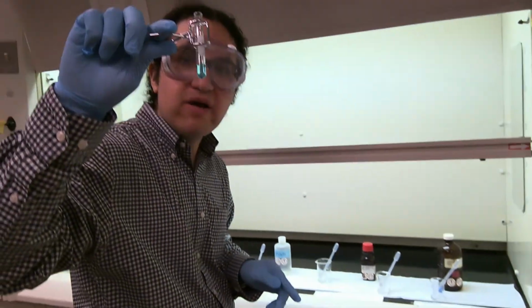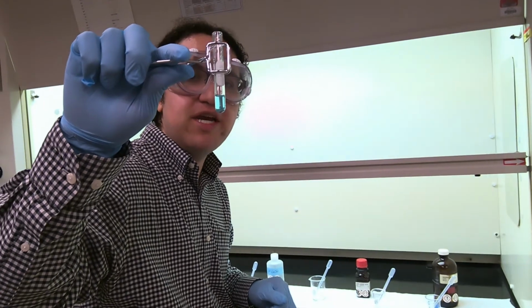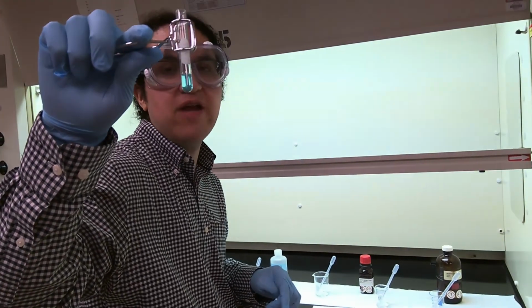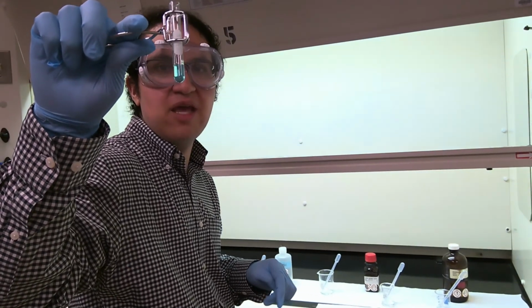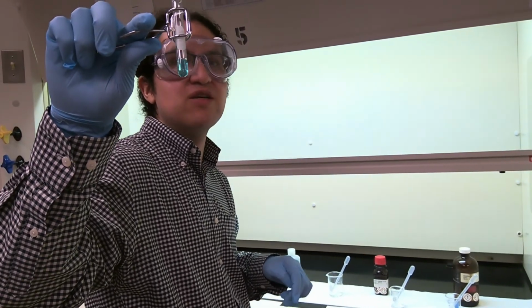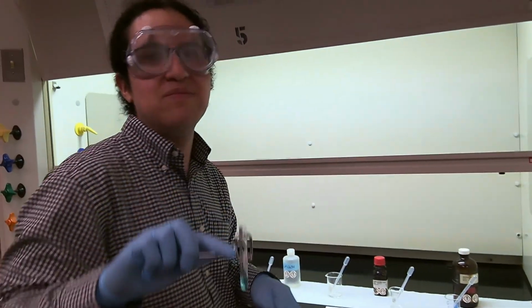I'd like you now to observe and appreciate the color of our solution after we've dissolved our copper oxide and reacted it with sulfuric acid. We'll repeat this process for our other two test tubes, and then we'll discuss the redox reaction with magnesium.